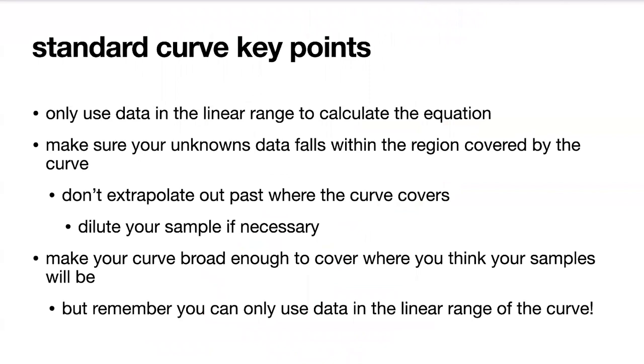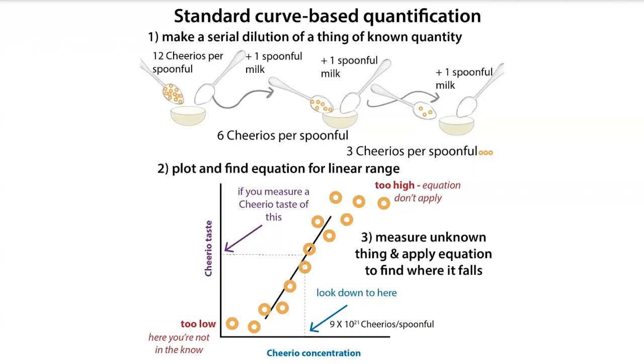So now let's get into more of the details. Now that I've given you those key points, hopefully you will take those away, if nothing else. But let's back up and go from the start. And let's start with a fun example. We'll start with a cereal dilution. And by cereal, I'm talking about my Cheerio example.